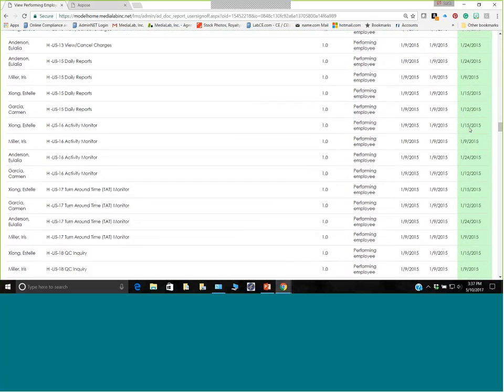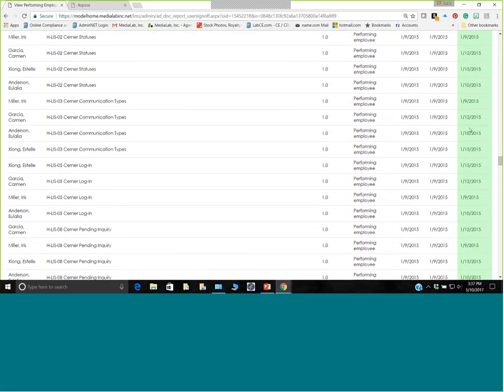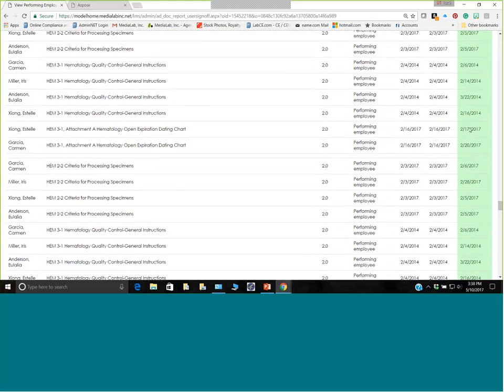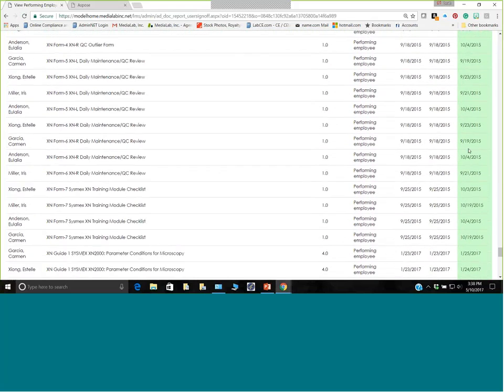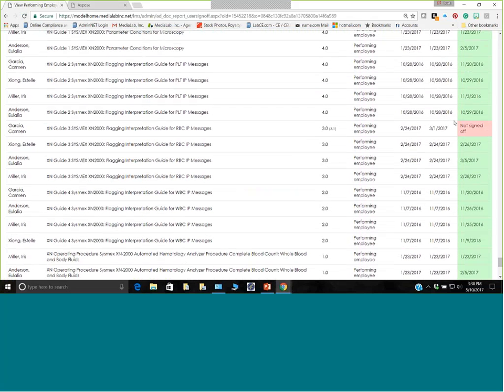And you can pull incomplete sign-off reports whenever you want. I used to call them the naughty list, and bring them to my supervisor's meetings. So if you do have someone who hasn't signed off, it's pretty obvious here on your report. And again, you can pull just incomplete sign-off reports as well if that's helpful for you.